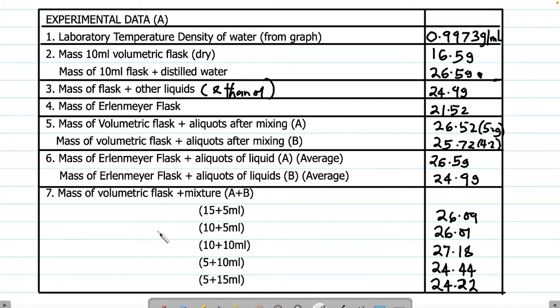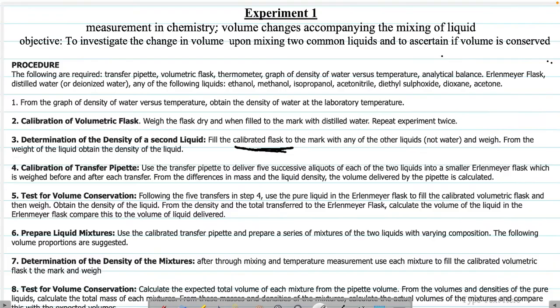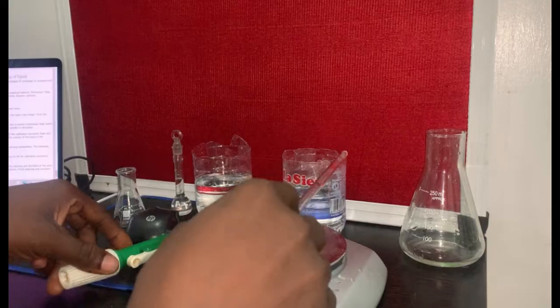All right, so let's look at the previous page, calibration of the pipette. Okay, so I made a video for this, but I'm going to play it now so that it will be very easy for us to understand. Okay, now look at procedure 4.